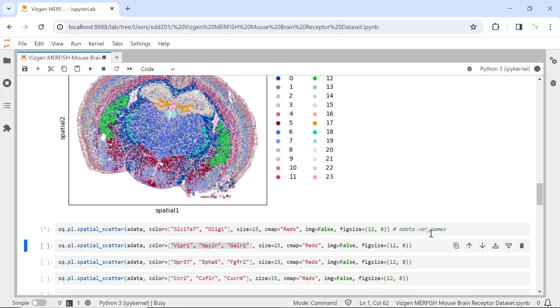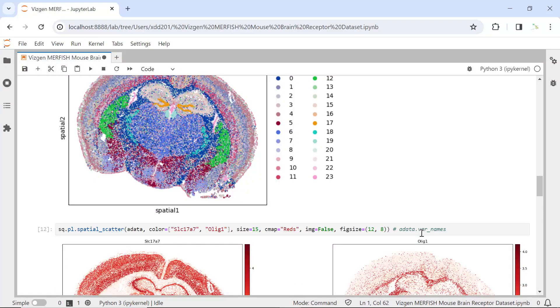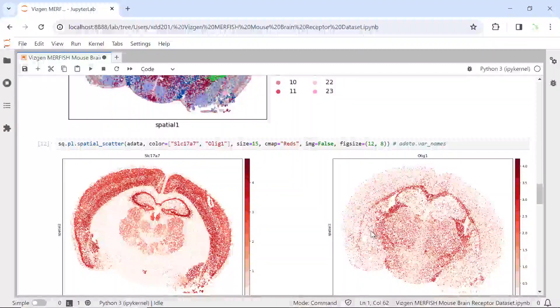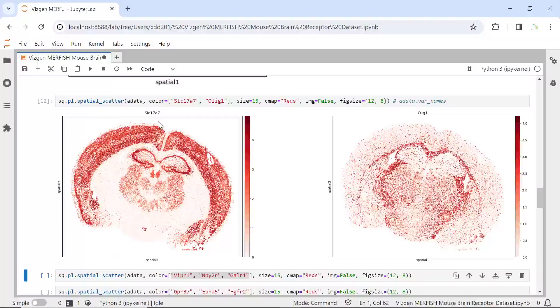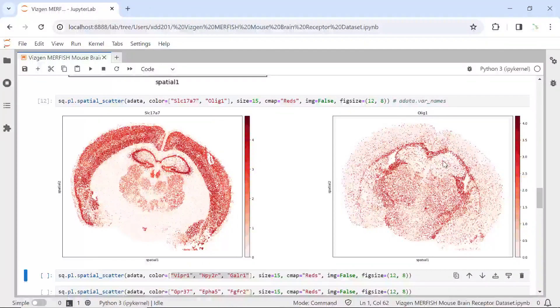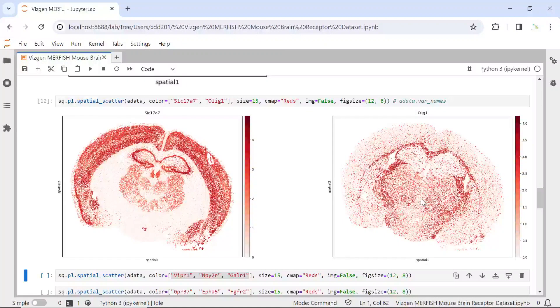If you want to see all the genes, they are in the AnnData variable names — we have 483 genes in this dataset. We can plot SLC17A7 and OLIG1 on the tissue to see where the neurons and oligodendrocytes are located. You can see SLC17A7 labels neurons in the cortex and hippocampus, and OLIG1 labels all the oligodendrocytes in the mouse brain. So following the analysis, we can visualize both cell clusters and gene expression on the tissue.